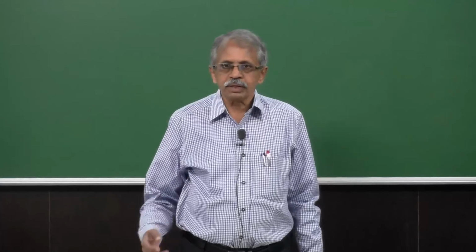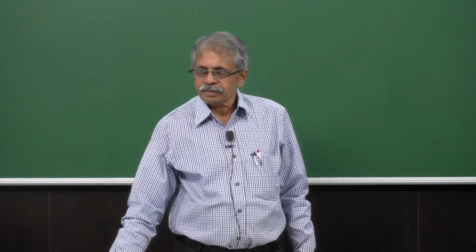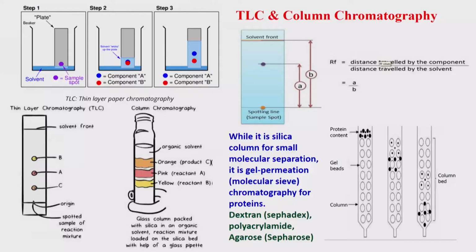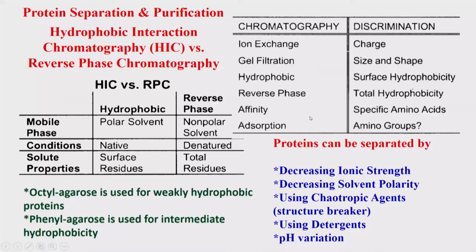And I tried to build all the principles required, particularly for the various kinds of chromatography techniques, like thin layer chromatography or column chromatography or size exclusion chromatography, or ion exchange chromatography, and chromatography based on affinity. I think with these 4, 5, 6 techniques, more or less you can cover the basics of the chromatography that is required in this particular course. And having covered all that, let me start moving on to the application or understanding or the process base.